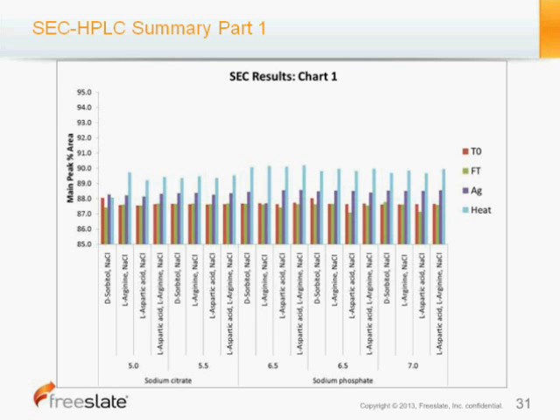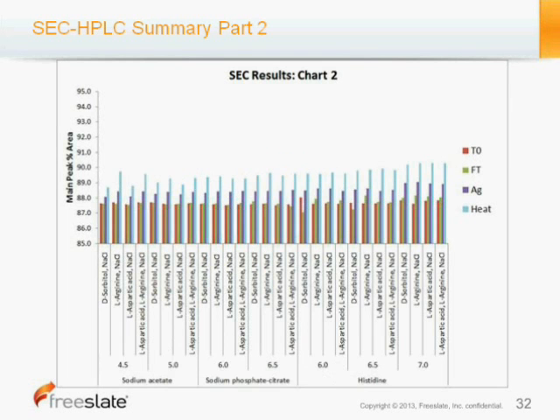And I'll move on to SEC chart number 2, which continues this sort of trend of T0s actually has some of the lower amounts of monomer, and there's just a very slight increase with the stresses, which is normally not what you would see with a biopharmaceutical, and I would say that most of these changes are within experimental error. So here we can see that sort of consistency between the formulations and a consistency between the different stressing conditions.